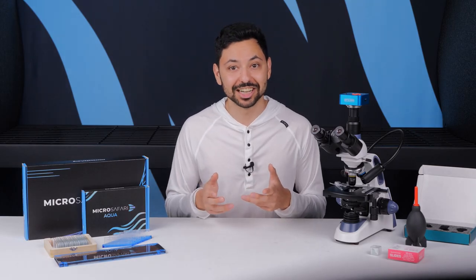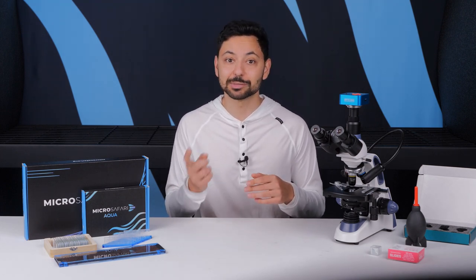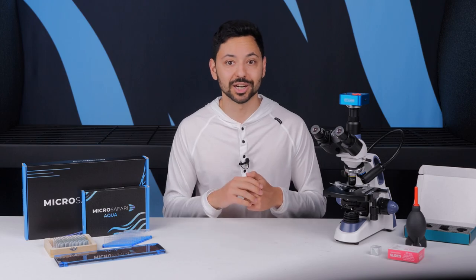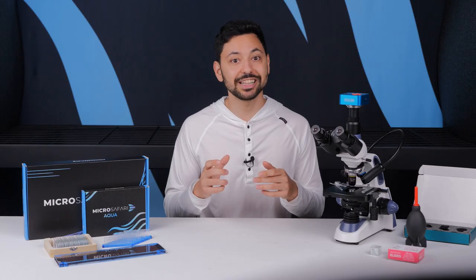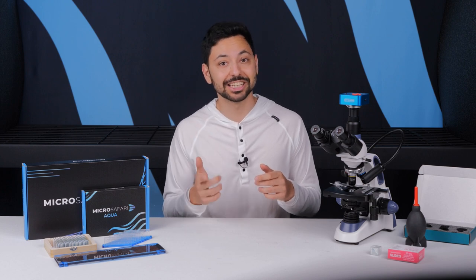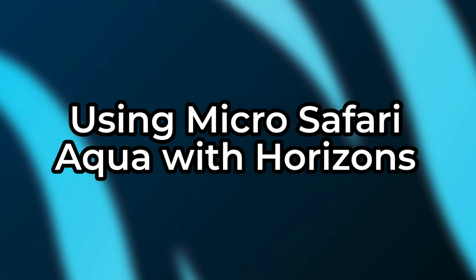If you happen to change the settings on your camera so bad and everything is messed up you can always go to the factory reset button and change the settings back to how they were when you got it out of the box. Cameras typically like to have a lot of light for best image quality so turning the LED all the way up and opening the condenser aperture may yield the best images with the least amount of noise.